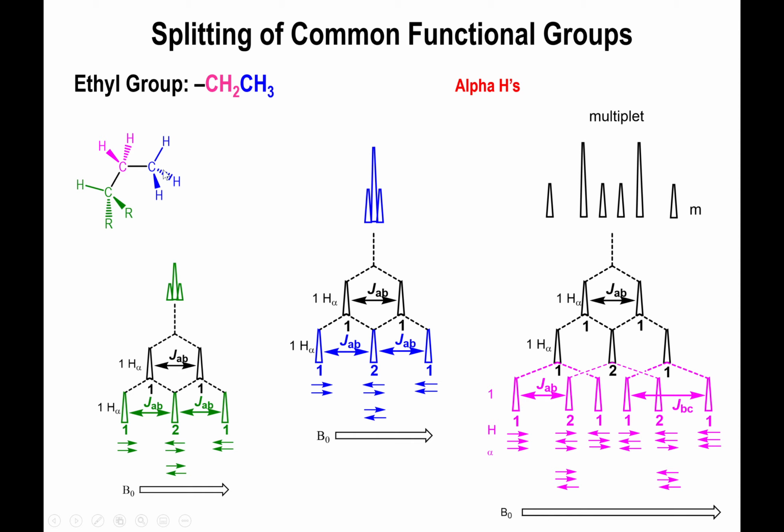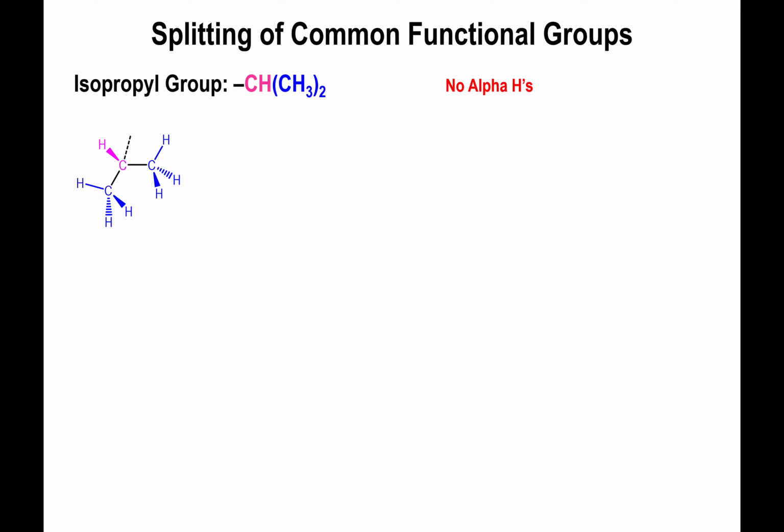So here, not only will you have your ethyl group split up into a triplet and multiplet, but then you'll also have the peak, of course, of the other carbon H that you have present in there. All right, but generally speaking, you're expecting to see a triplet and quartet, or a triplet and multiplet, if there is an ethyl group present.